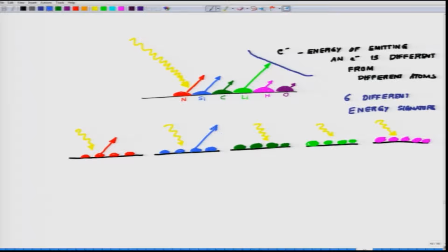So you have the basic table at your disposal, the library of E values, or energy values, for different elements.